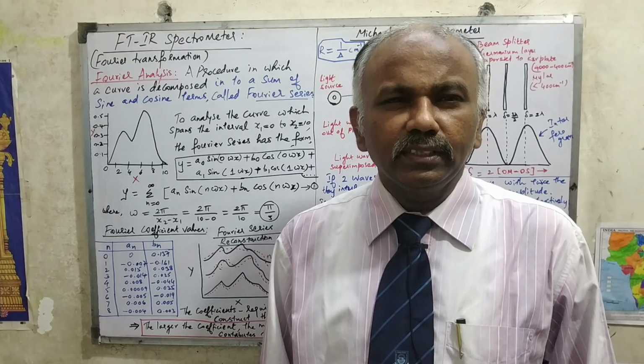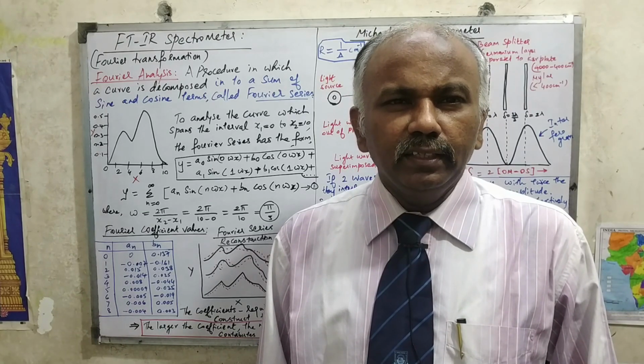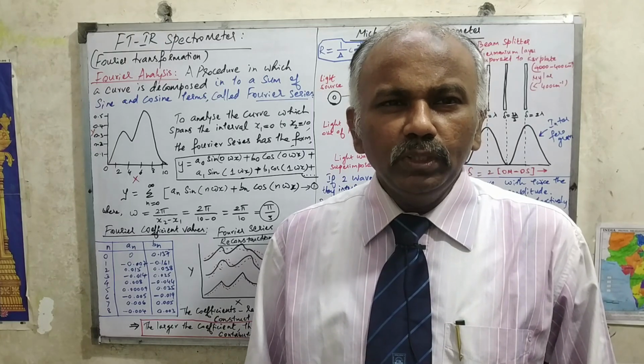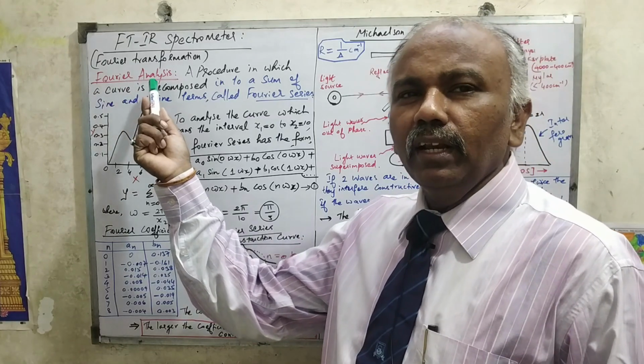Today I am going to discuss the topic of the FTIR spectrometer. What is this FTIR? FTIR refers to Fourier transform infrared spectrometer. How does this basically work? Basically you should know the meaning of Fourier analysis.